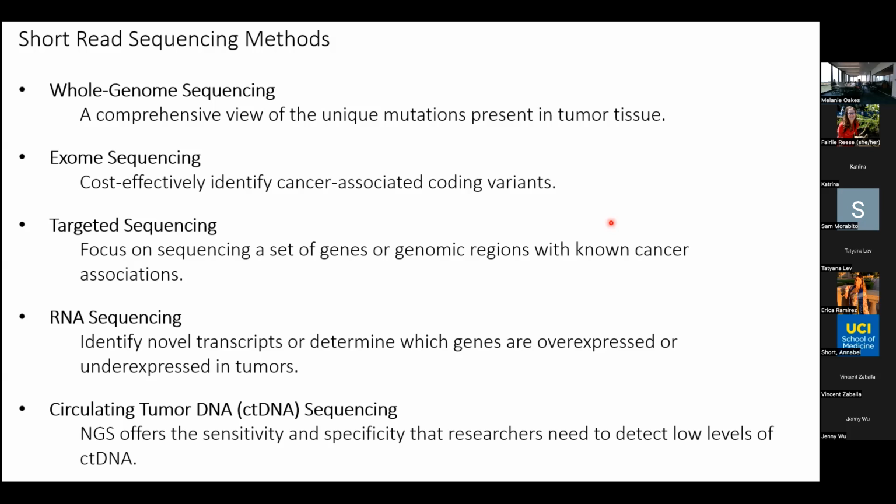We can do targeted sequencing. Most of our targeted sequencing is actually 16S, people looking at microbiome type work. RNA sequencing, we also do some circulating tumor. So these are some of the applications that we're seeing with short read.